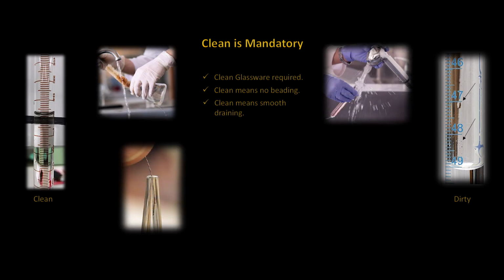The solvents used to clean glassware vary. A chromic acid solution may be used. It is a solution made by dissolving potassium dichromate in a solution of sulfuric acid. However, this solution is quite toxic and corrosive. It may require special disposal.